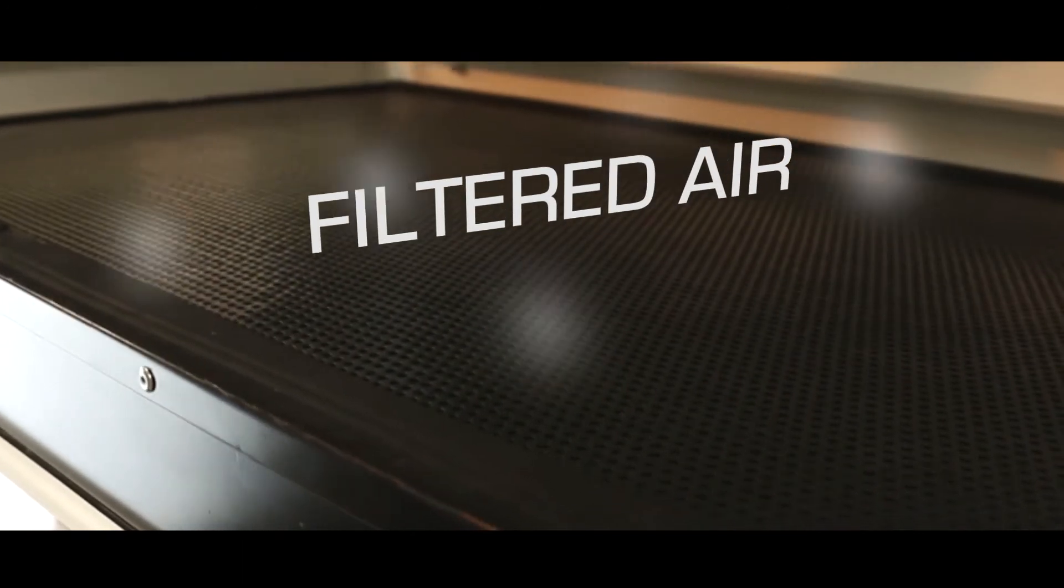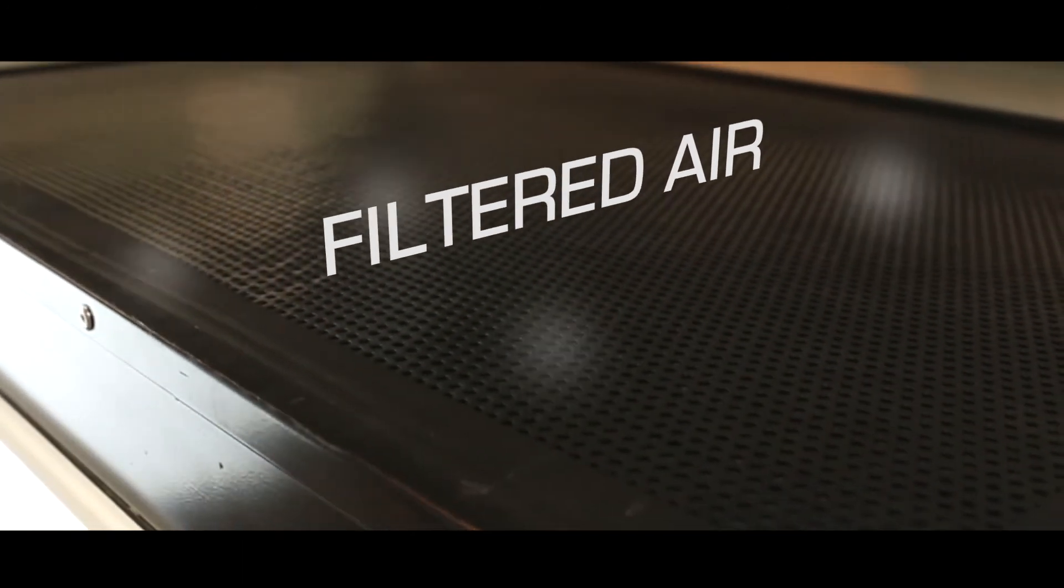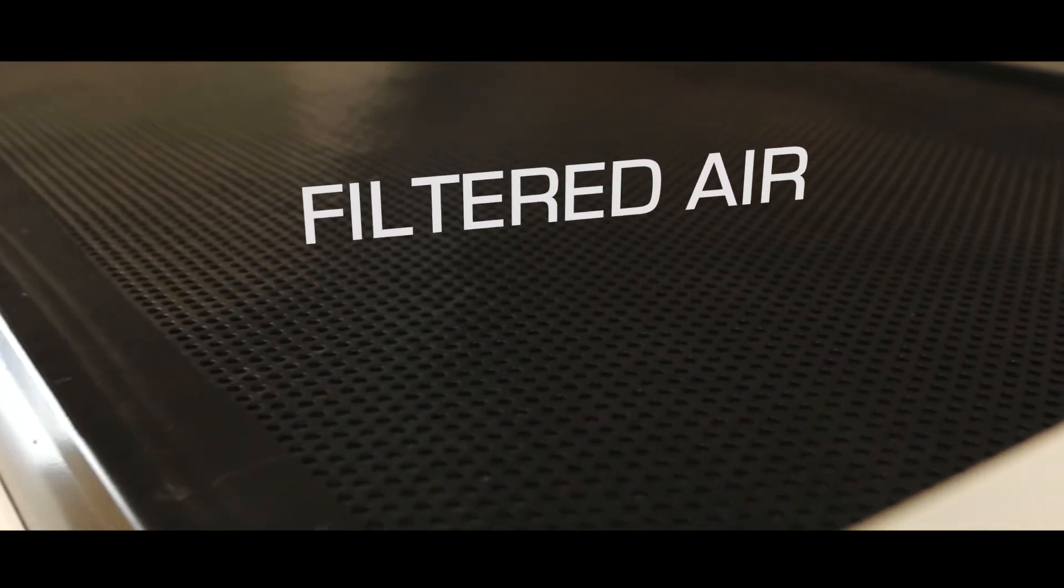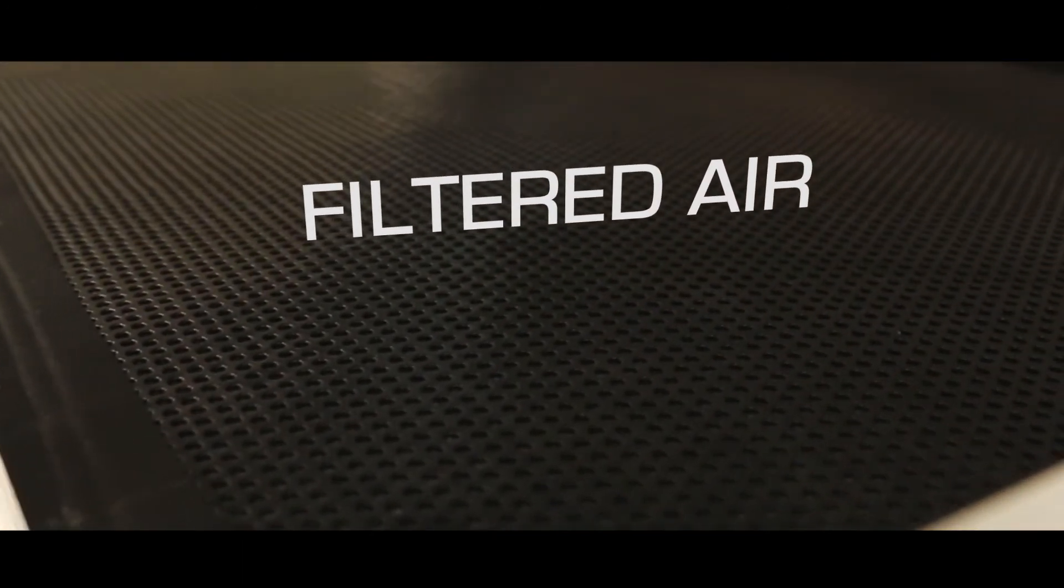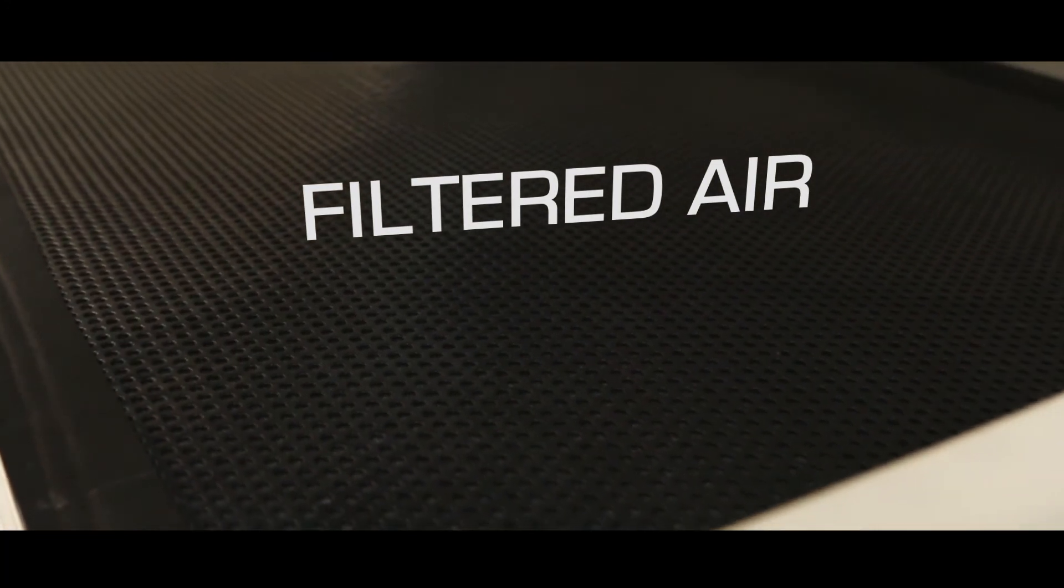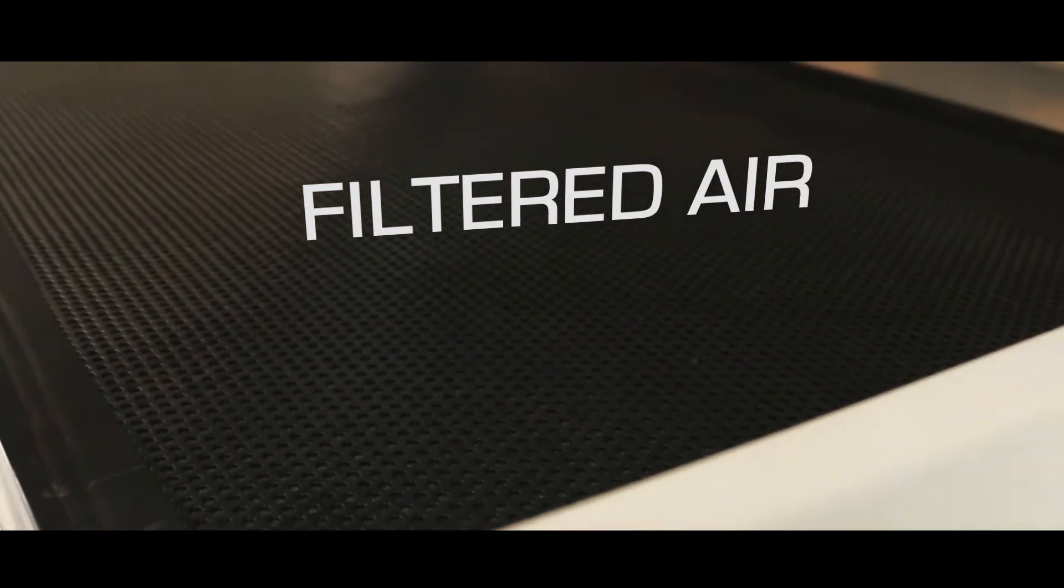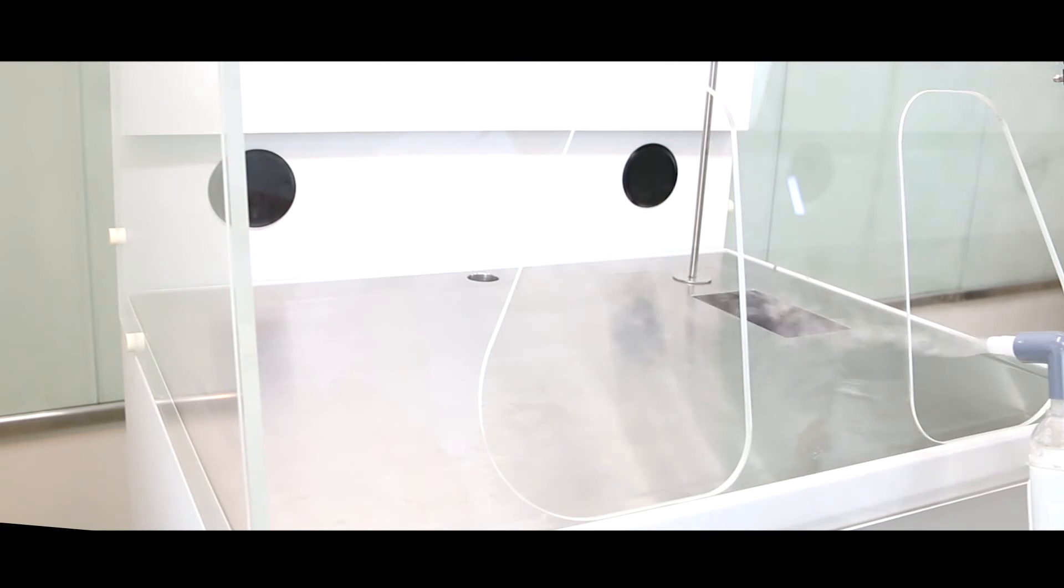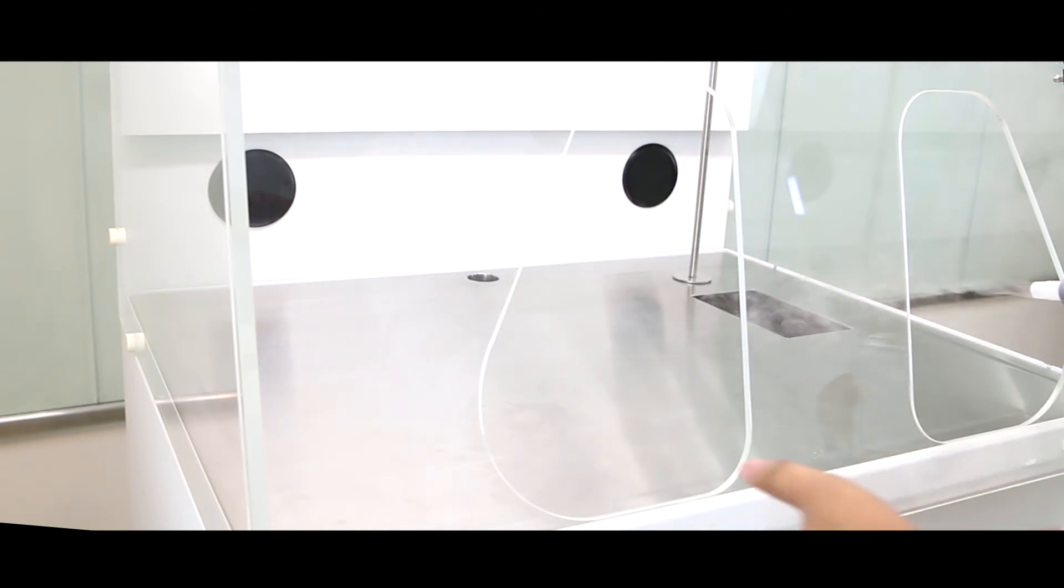The Formax is equipped with Esco's Nanocarb Activated Carbon Filter to absorb formaldehyde gases and release filtered clean air back to the laboratory. The hood is perfectly designed to ensure effective containment and removal of fumes from the work zone.